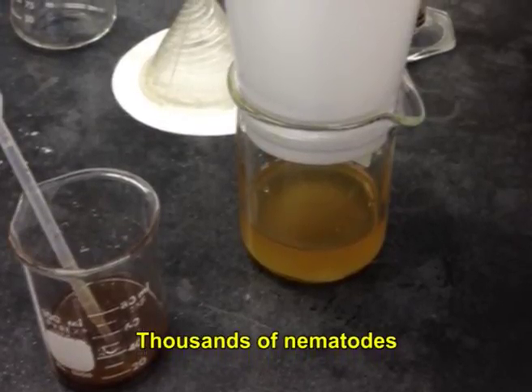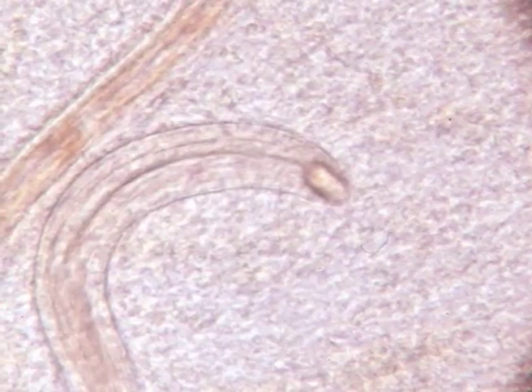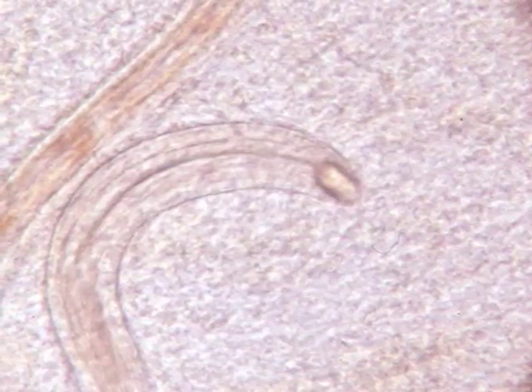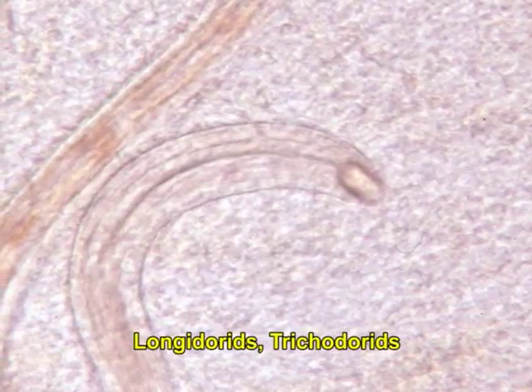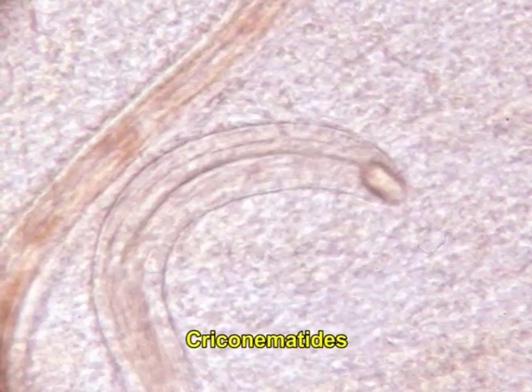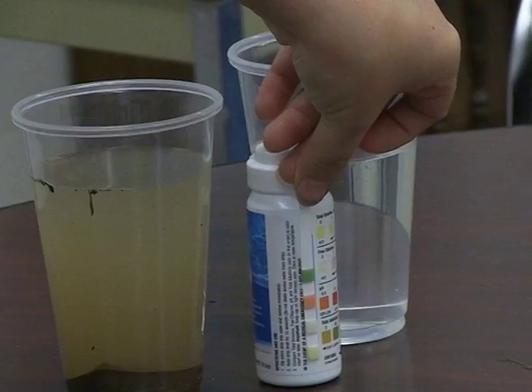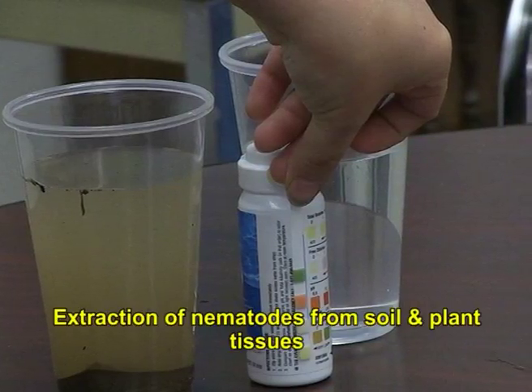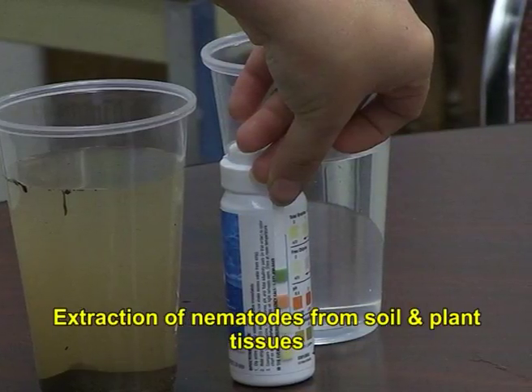This method is referred to as the active method and is not helpful for inactive nematodes like Longidorids, Trichodorids and Criconematids. Thus, the technique has been modified and supplemented with other techniques so that it becomes the standard method for extraction of nematodes from soil and plant tissues.